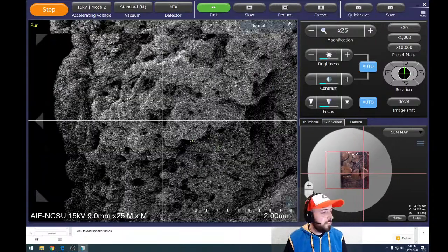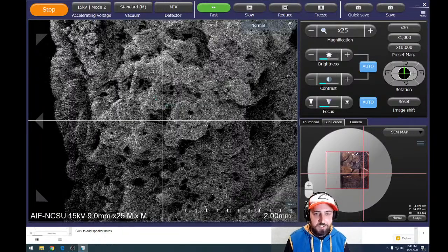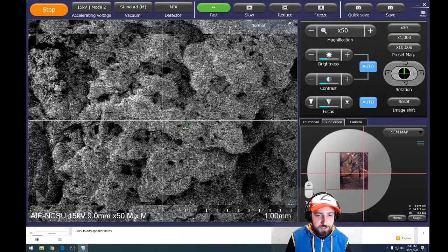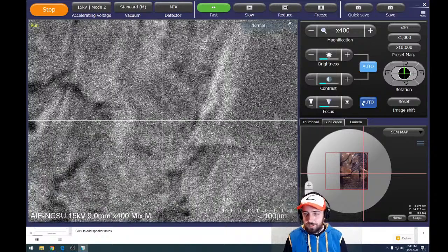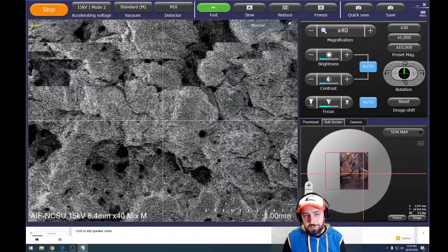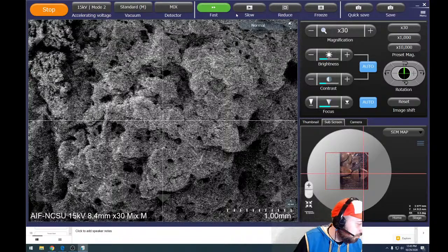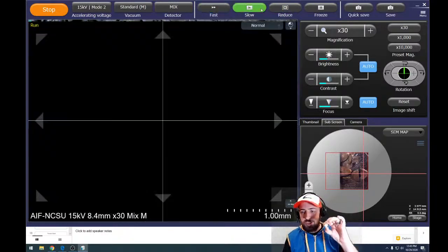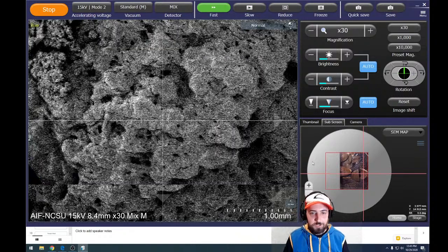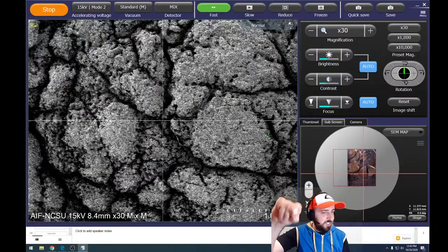So I figured we'd look at marshmallow, since we have marshmallow as a key ingredient in the candy corn and the marshmallow pumpkins. Think about marshmallow and what you know about marshmallows, right? They're light, they're kind of fluffy, and I've always thought they were kind of squishy. Right now we're looking at, actually no, we're looking at the inside. I want to look at the surface real quick. So this would be the outside of the marshmallow, and we know that it's kind of squishy.